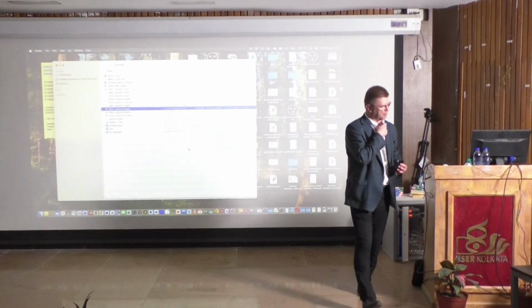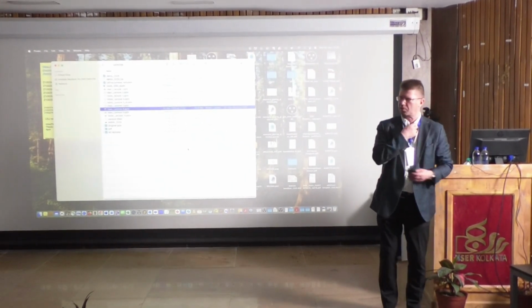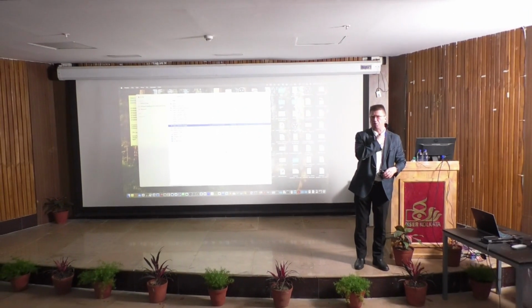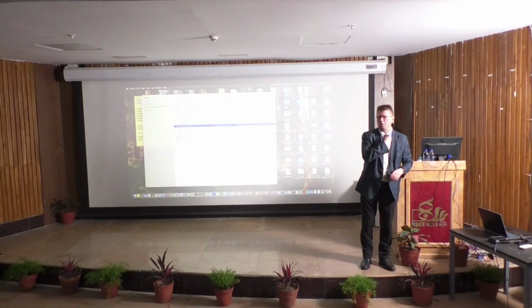So, do we have time for a question? Yes, of course. You can ask. We have 10 minutes. But if you have any questions, please ask. Anyone? Yes.